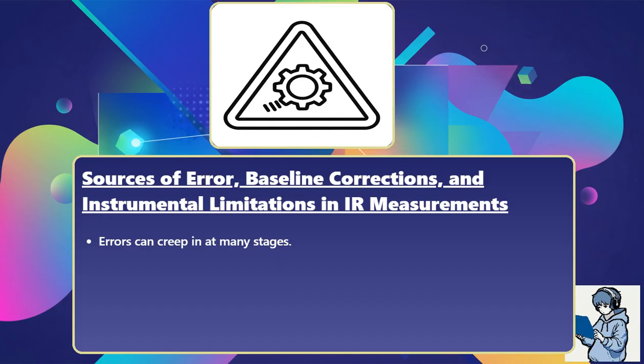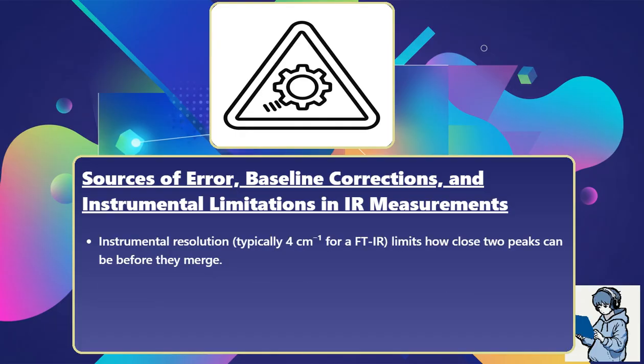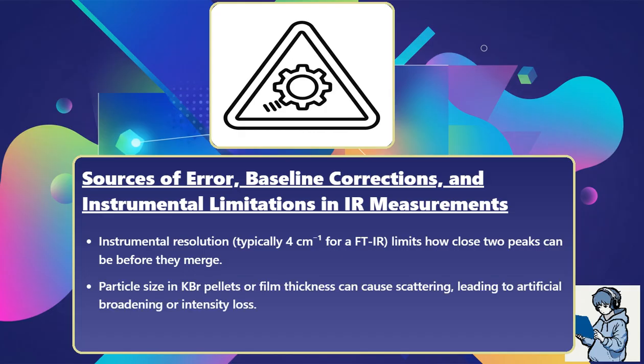Errors can creep in at many stages. Baseline drift occurs when the detector signal slowly changes, giving a sloping background that masks weak bands. You correct it by subtracting a smooth baseline. Instrumental resolution, typically 4 inverse centimeters for an FTIR, limits how close two peaks can be before they merge. Particle size in KBr pellets or film thickness can cause scattering, leading to artificial broadening or intensity loss.